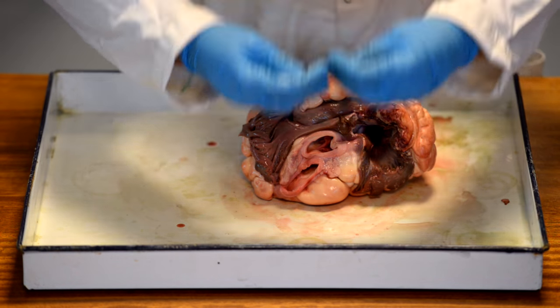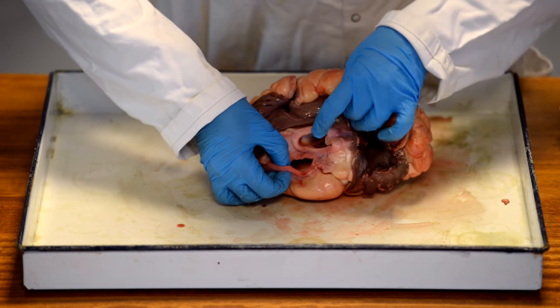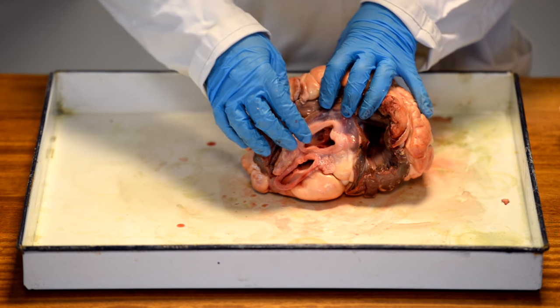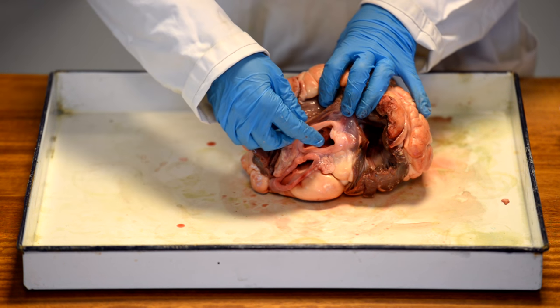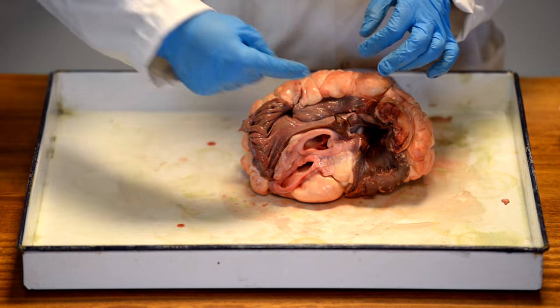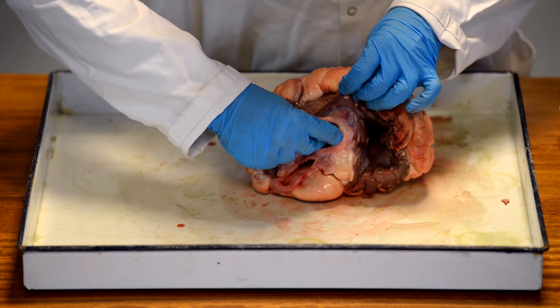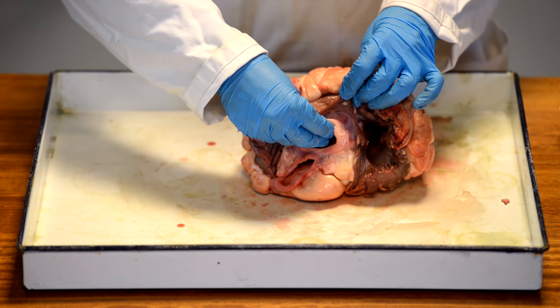Arteries go away from the heart. If you have a look, you can actually see that these blood vessels have different thickness walls. This one has got the thickest walls of all. This is the aorta. And in us, the aorta would be wide enough for us to put about a finger's width. In this ox, I can easily get almost all of my hand into there.